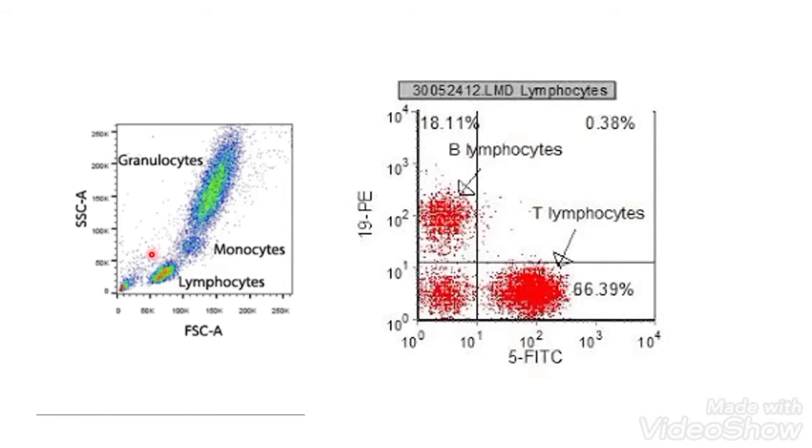So similarly, by using the software, we can select these cells. Once I select that, the instrument automatically gives me the percentage and counts how many cells are coming into this gate or selected area. Immediately, within seconds, I find that in my PBMCs, what is the percentage of lymphocytes? What is the percentage of monocytes? What is the percentage of what? Granulocytes. So this whole experiment is taking 35 minutes and you are having the exact count of lymphocytes, monocytes and what?